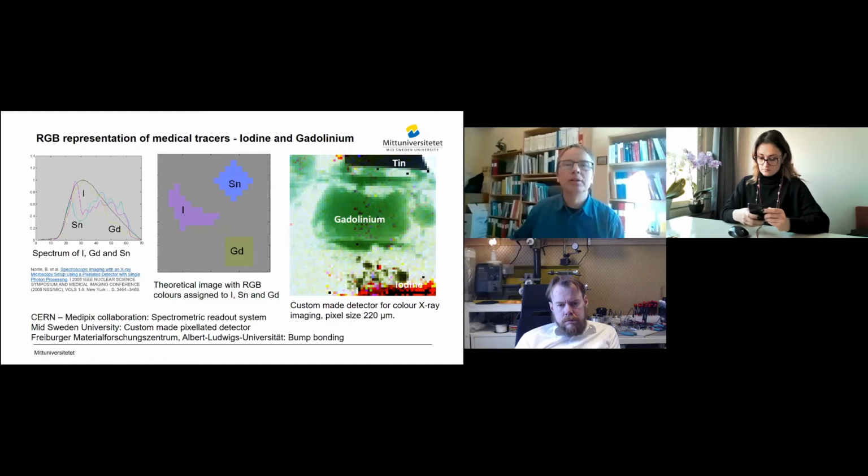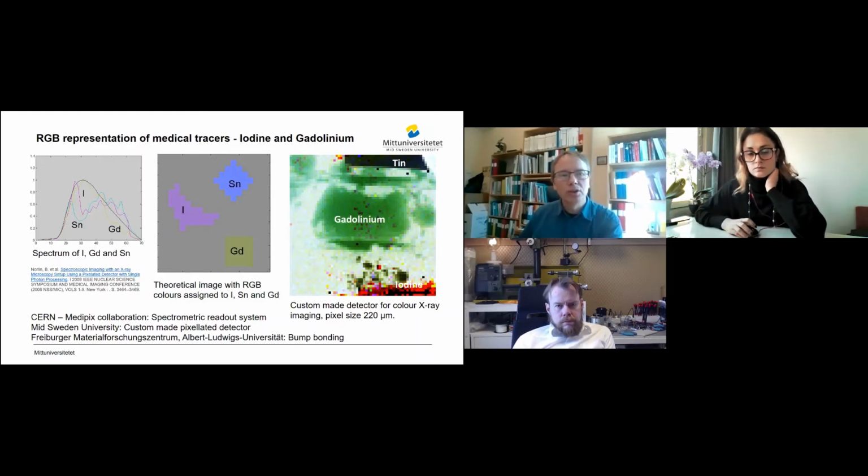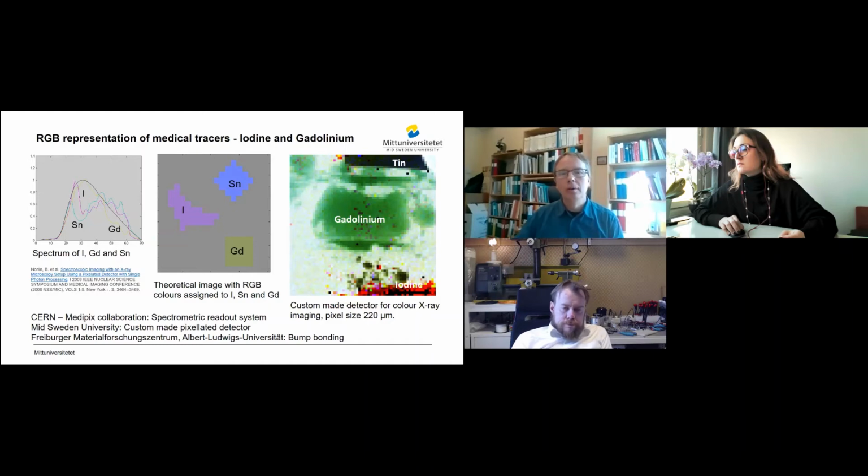The tin sample is a little too thick, it gets a little black, but you can see that you still have this type of color. So I made an RGB mapping of these samples, to demonstrate that it's possible. The RGB was just taking the spectrum and correlating it to a visual representation. There are more advanced material mapping schemes.